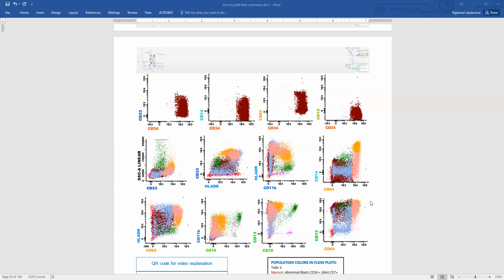So we have myeloid blasts, and this blast is continuous with an immature monocyte population that has CD64 expression, HLA-DR, CD33, and it is partial positive for 11B and 14. And we have a population of mature monocytes. So we have myeloid blasts that are going towards myeloid maturation, and there is a subset of blasts that are going in the monocyte lineage of maturation. So this is an acute myelomonocytic leukemia picture, and in this particular case, FISH studies were positive for inversion 16.